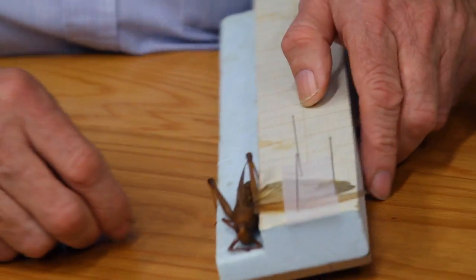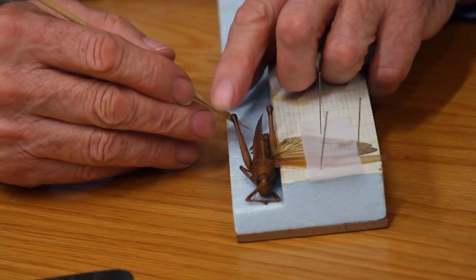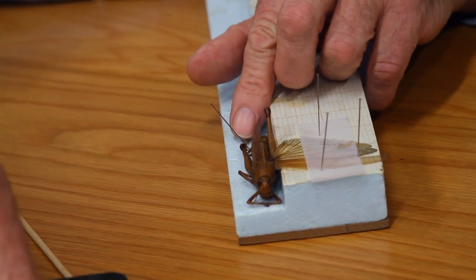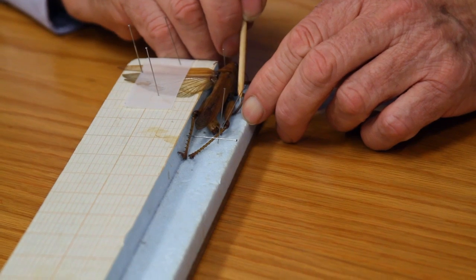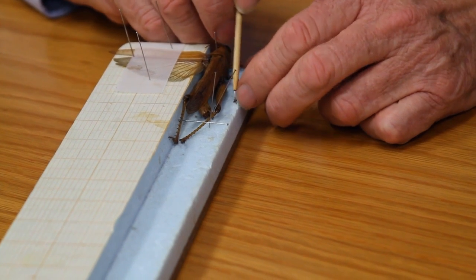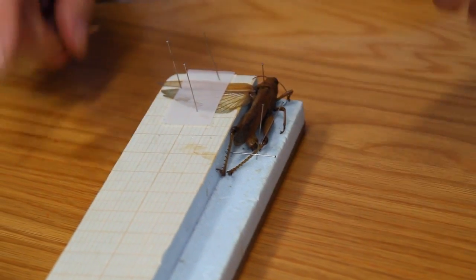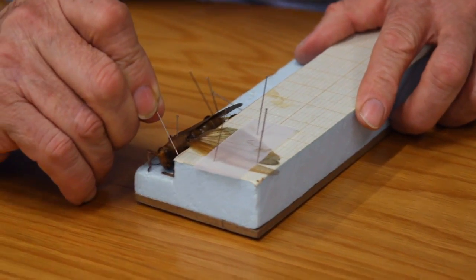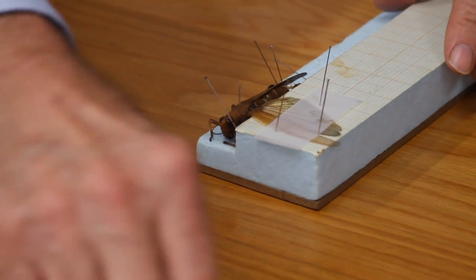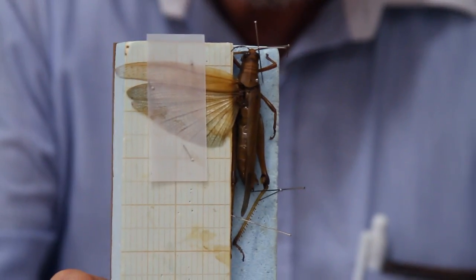The next part of the pinning is to get the legs in a position for identification. We try and set the second pair of legs away from underneath the body so we can see them, and the same with the foreleg. Then we work on the antennae, pulling them around so they're looking in a normal position. And there we have the grasshopper pinned.